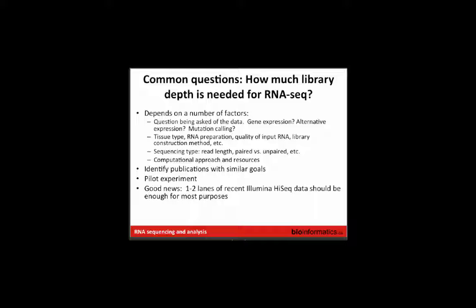Yeah, so it's not for any prep. The prep may influence. If you have sufficient RNA quality to do the mRNA or poly A selection, that will allow you to generate less data and get a sufficient result. But for total RNA-seq, you might. Yeah, I mean, we found that one lane is fine for our total RNA-seq libraries.